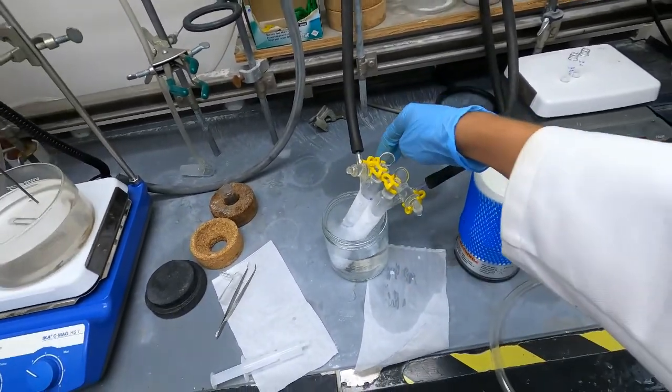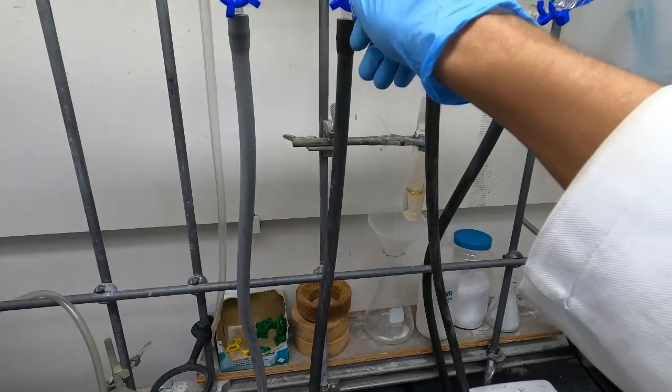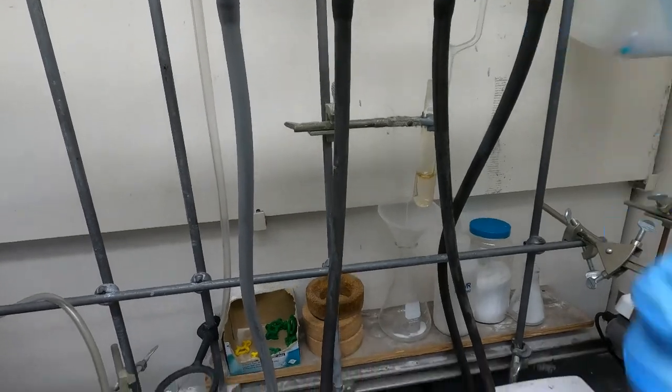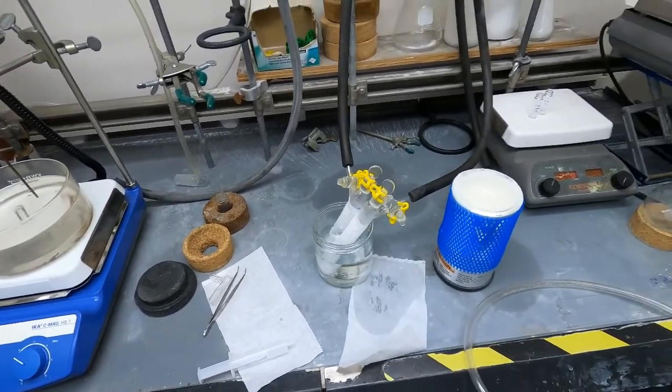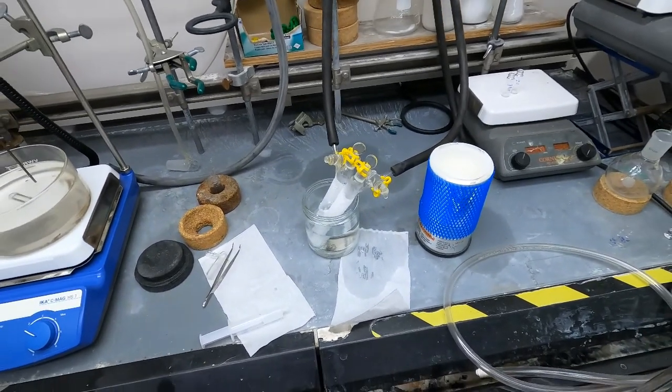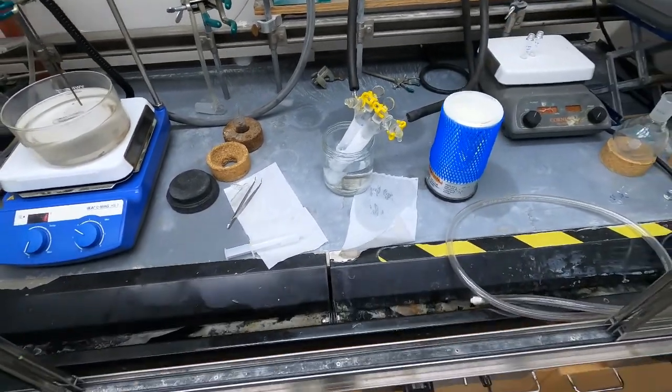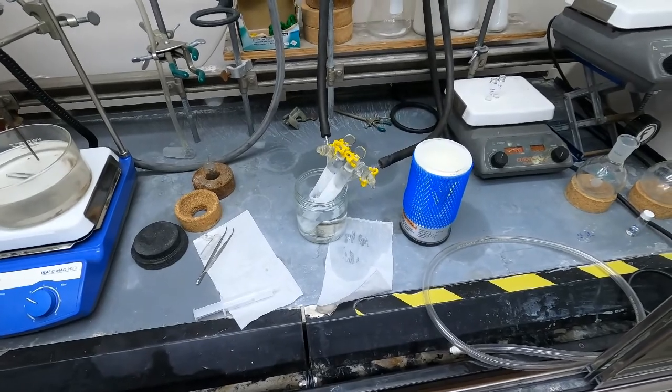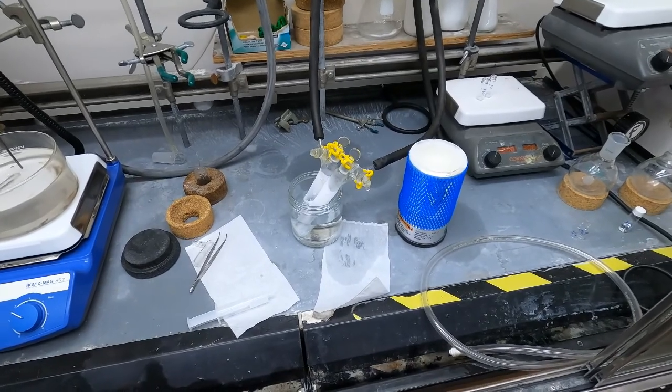Both of the stopcocks are closed and these lines are currently under vacuum but we're going to backfill with nitrogen. Now these vacuum lines are filled with nitrogen. Currently the tubes are totally degassed. We have our reaction mixture in there but the tubes are under vacuum. If you wanted to just degas you could disconnect the vacuum lines right now. But in my case I'm interested in running this reaction under nitrogen so I'm going to backfill with nitrogen.